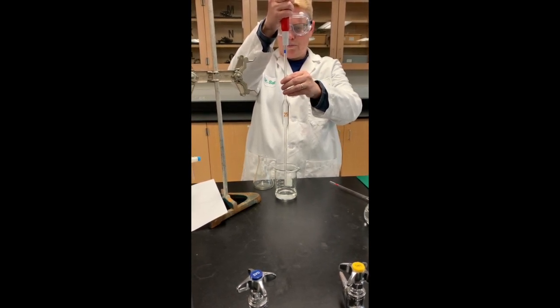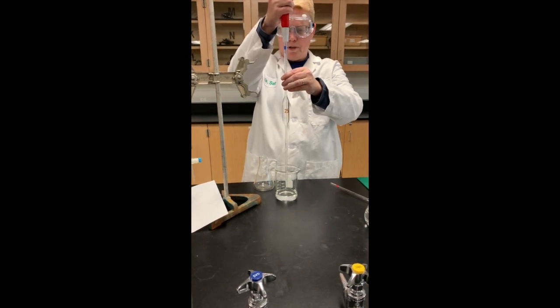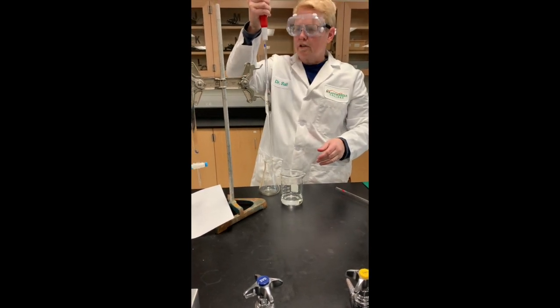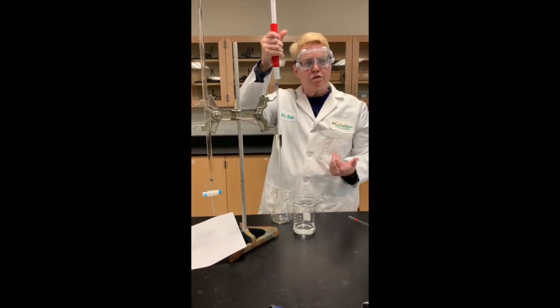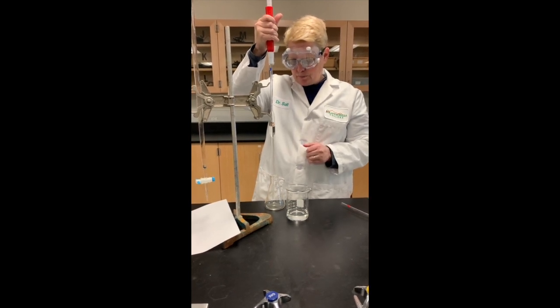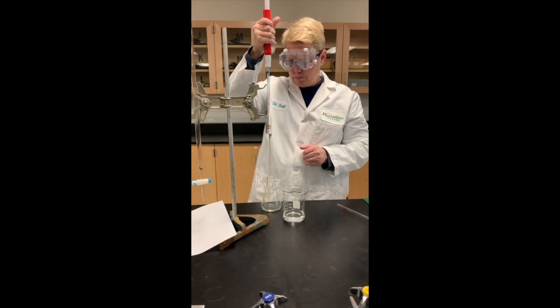And you can control a little bit with it. Just a little bit more. And there we have it. So now when you transfer it over here, you push on the lever and it releases it. And that gets you exactly 25 milliliters. It's much better than using a graduated cylinder. You have an exact amount in here. It takes a little bit of time for this to drain, but that's okay. We have patience.